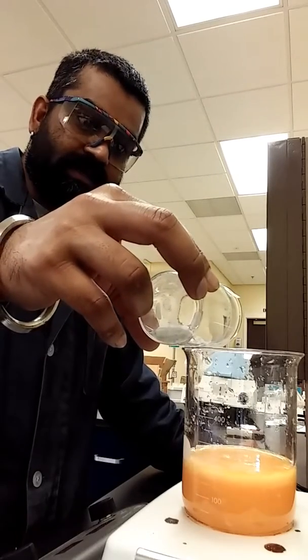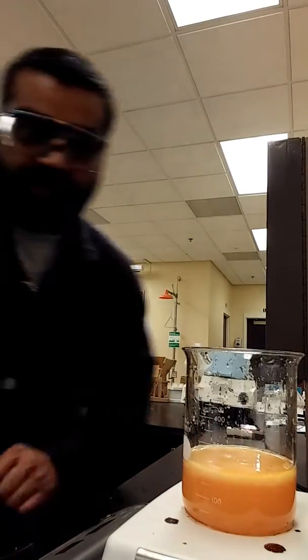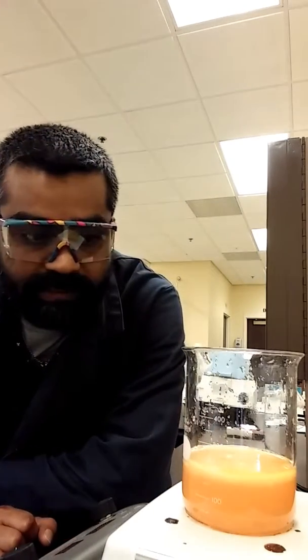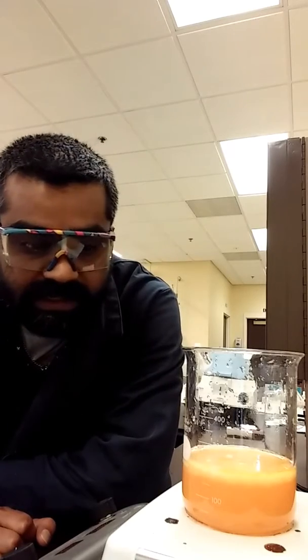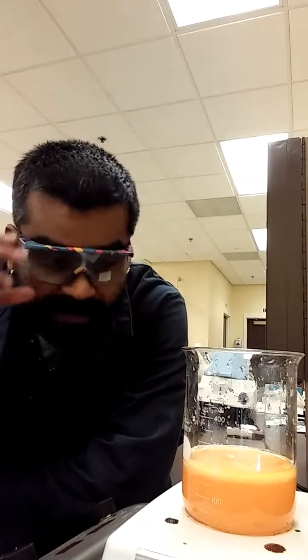You see it? Right away. You notice? You see a milky white substance forming inside that orange liquid. That's the precipitate of calcium citrate.